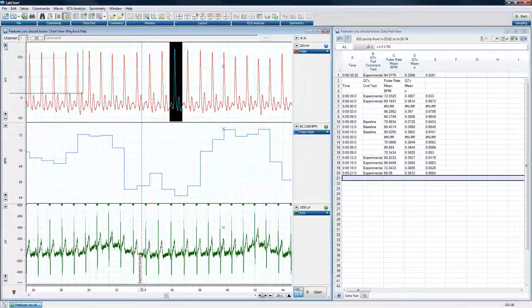That means you can be very specific about the y-axis. If you set the scale on the y-axis by going to Set Scale here on this option, you can then be very specific about the y-axis. That means when you're creating images, you can be very specific about the y-axis.